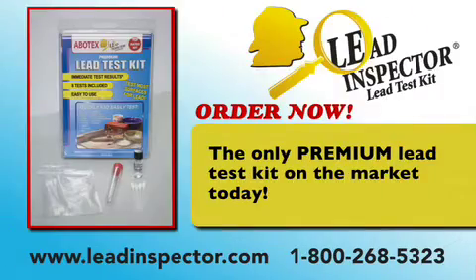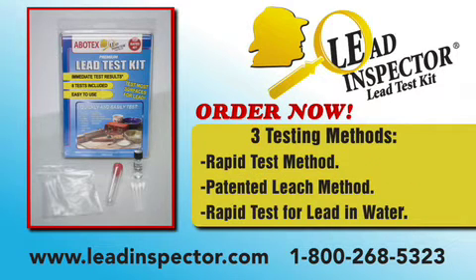Now let's find out how the Lead Inspector works and how you can screen for your own risks at home. Lead Inspector is the only premium lead test kit on the market that will test surfaces for lead as well as water and tell you the approximate lead release in the sample. The Lead Inspector is easy to use, convenient, economical, and reliable.